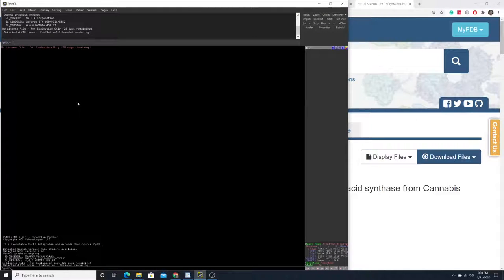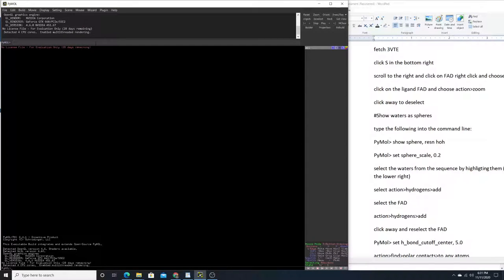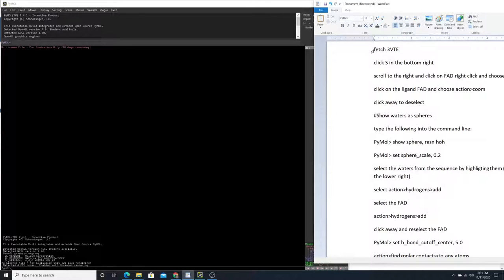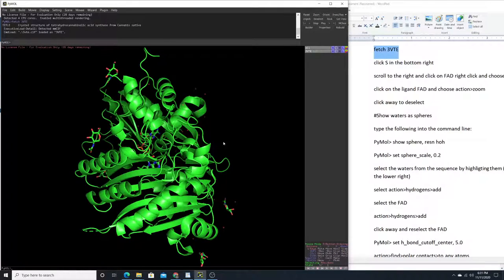We're going to do this in PyMOL and we can fetch that PDB file directly within PyMOL. I'll have a list of commands here that we're going to use to accomplish this entire process — I'll publish those commands and put a link down below. First we're going to type, line by line, 'fetch 3VTE' into the command line.